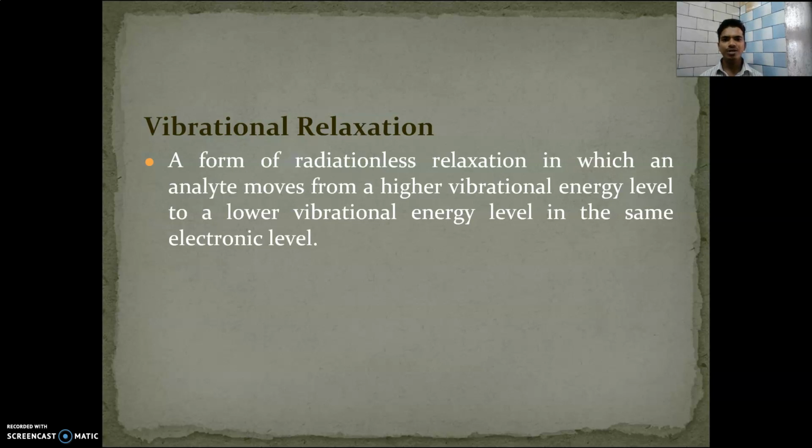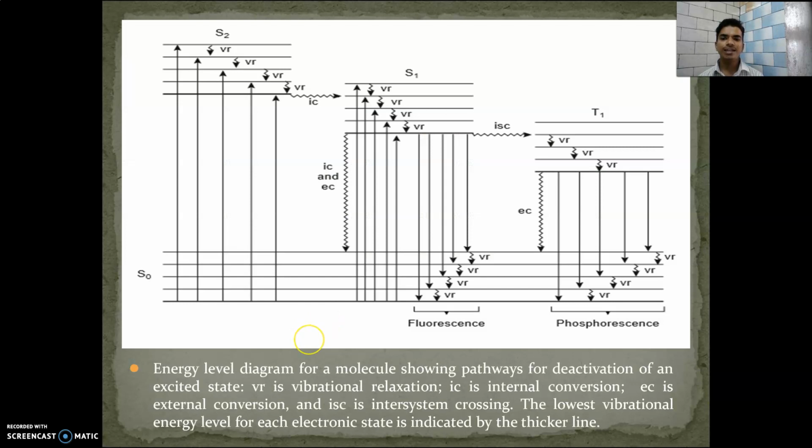This is the energy level diagram for a molecule showing the pathways for deactivation of the excited state.